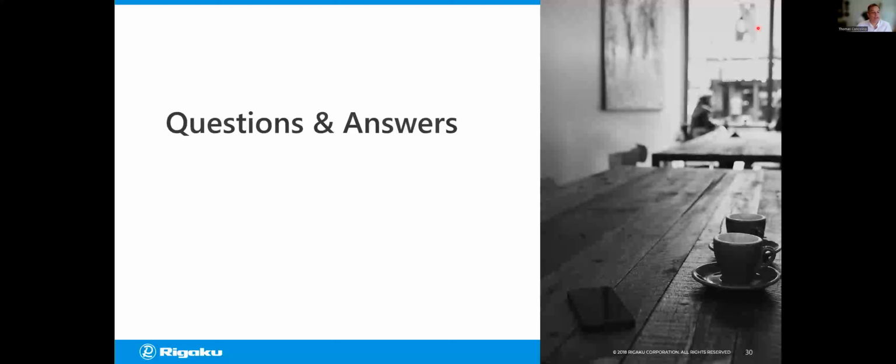Daniel's comment here is a little longer, so I'm going to read this out loud. He doesn't have large quantities of samples, and they're not all that stable, so it's not always possible for him to do multiple data collections and then average them out. And so the diffraction angle, the peak positions, can change from the standards. So I think he's asking whether there is some machine learning that can be done here, where these shifts can occur, and you can set it so that the software starts to build almost its own calibration setting based on his own material.